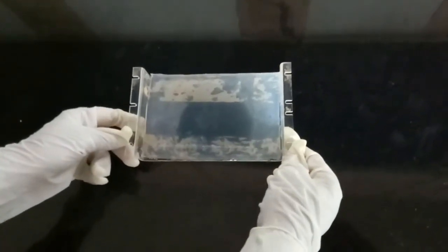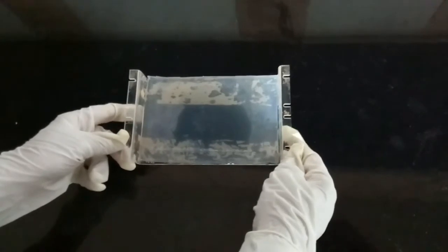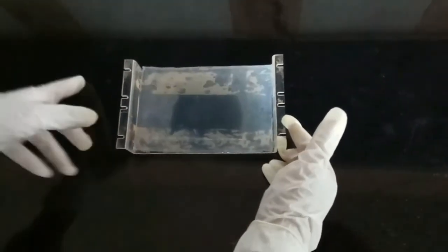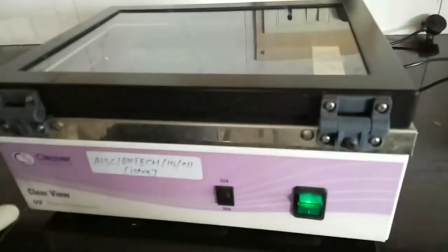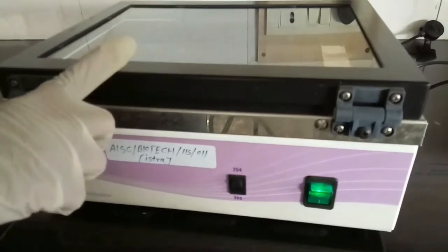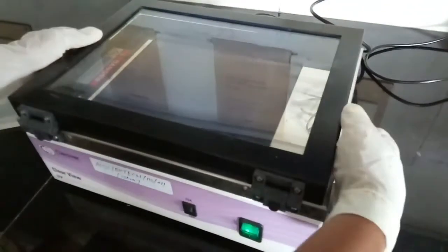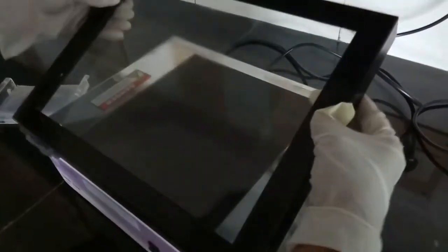We have done agarose gel electrophoresis. We have separated our DNA bands on the agarose gel. Now we will place the gel on the UV transilluminator. This is the UV transilluminator. So first we will open the lid of the UV transilluminator. Now we will place the agarose gel on the UV transilluminator.